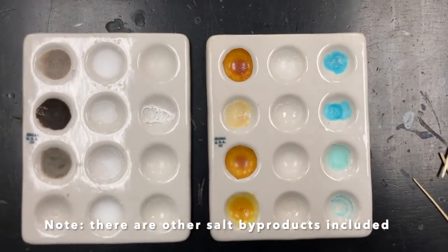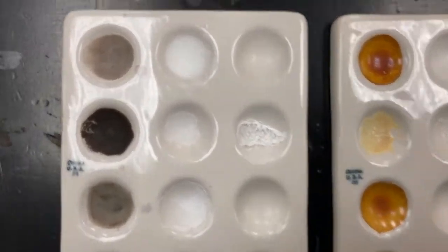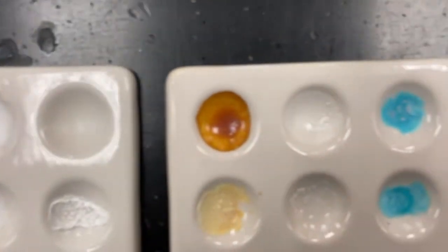So I've let these sit overnight and the water has evaporated, so now you can clearly see the solid that's left behind.